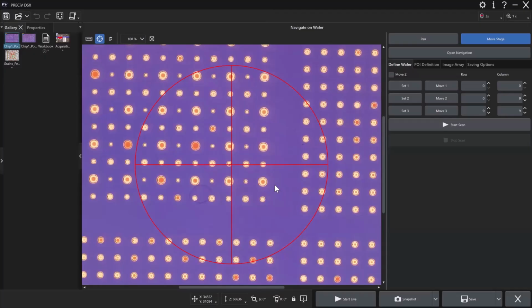One thing to mention is we do have desktop licenses of the software. So if they wanted to do all the image capturing in the tool, in the fab, suited up or something like that, but they don't want to review all these pictures, they could use desktop license software back at the office on the laptop and navigate to where these images were saved to the network location and review them after the defect and still take measurements on them. They're fully calibrated images. Okay.